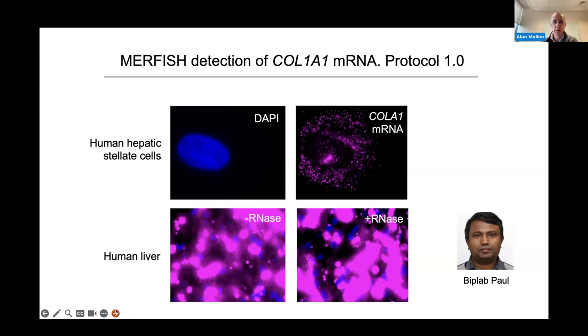What we are seeing here is the bleed-through of lipofuscin as an autofluorescence in really every channel that we looked at. That was not dependent in any way on the RNase activity, and it wasn't picking up any RNA. It was actually more of a debris that was really hard to digest and certainly becomes more prominent with age in patients if we're looking at the liver.